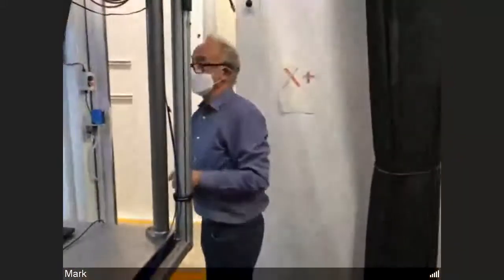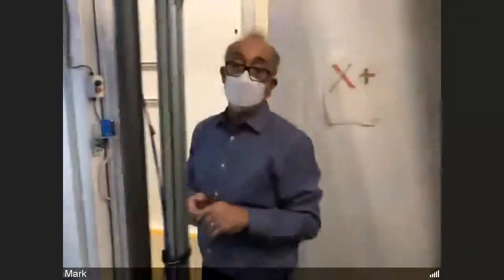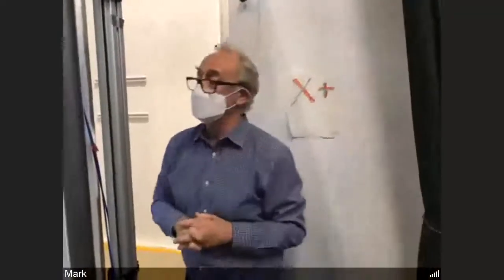One of the things with the tomography, of course, is we're measuring visible light from the scintillator. So it has to be dark in here when we're making the measurements. So one of the things you have to remember to do is turn out all the lights when you leave the room.